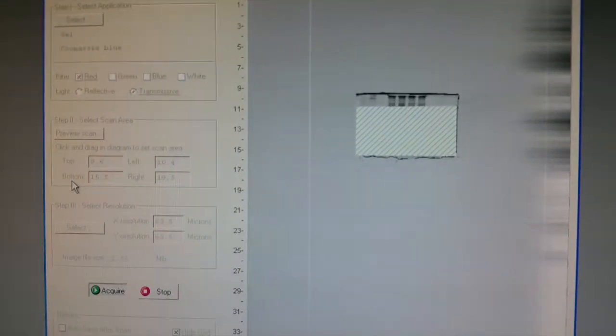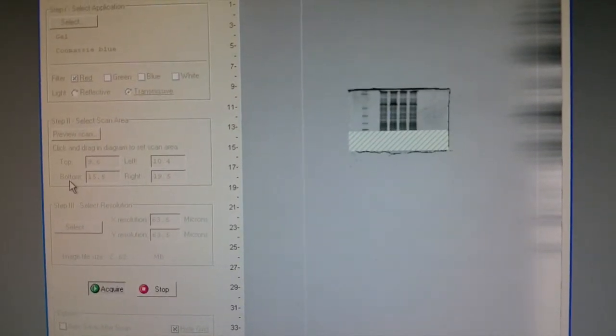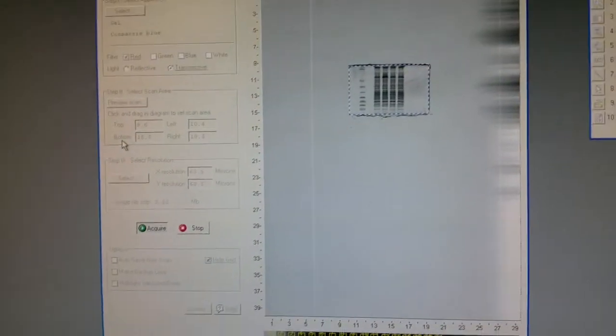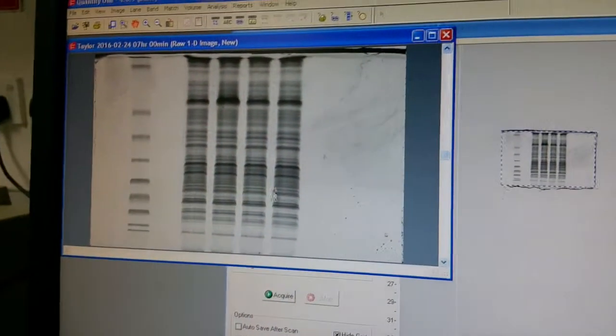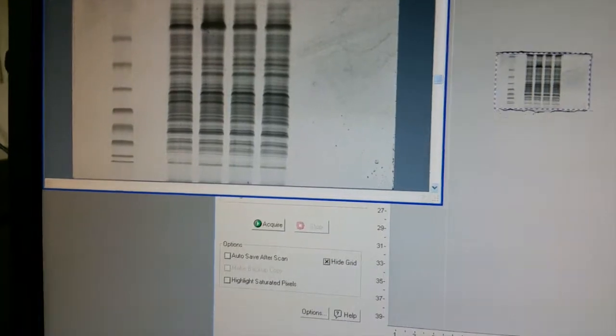You can see it just scanned that particular gel and then it stops. The scanned photo will then pop up.